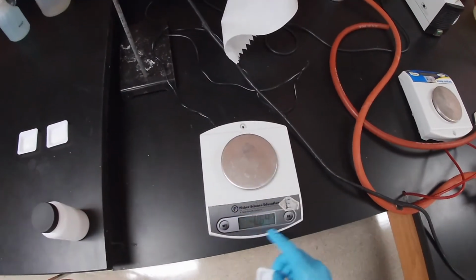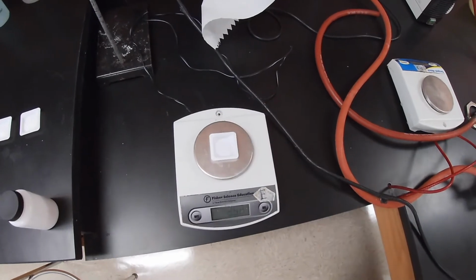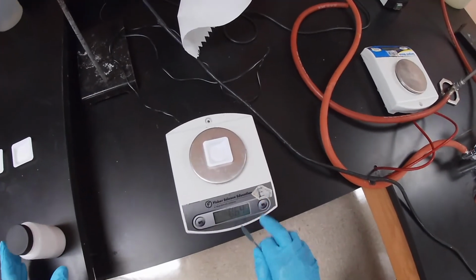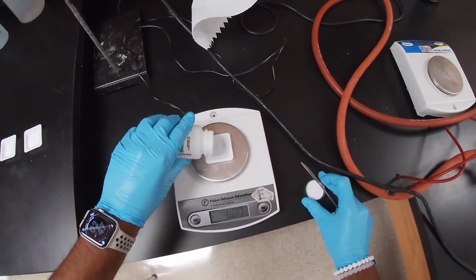And then we're gonna go ahead and zero it out. Put our third weighing boat. This one's gonna be 5 grams, okay? So we're gonna go ahead and weigh 5 grams out.